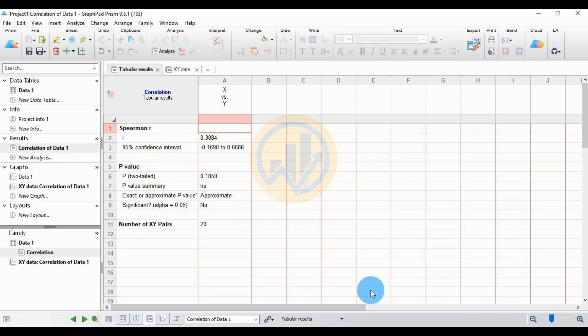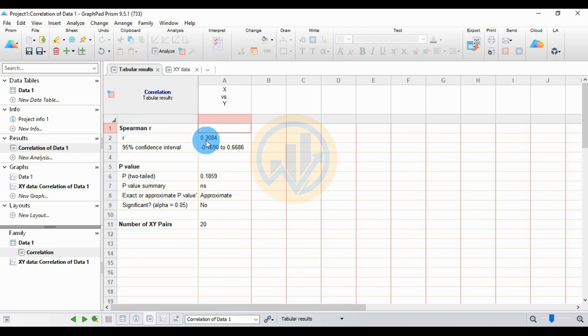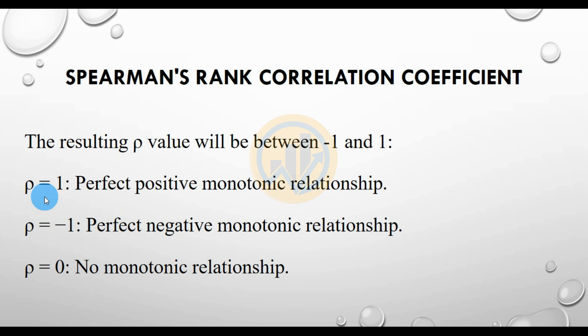Now the Spearman correlation coefficients are calculated in GraphPad Prism. The r value is 0.3084, which is a positive value, indicating a positive monotonic relationship between the two variables.